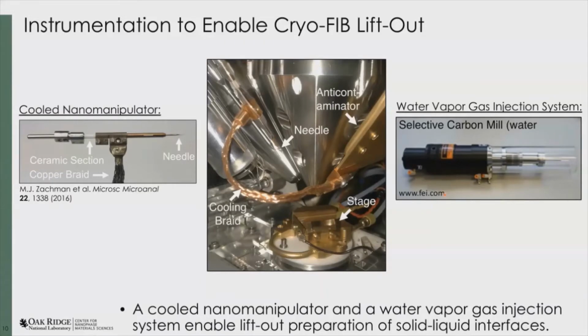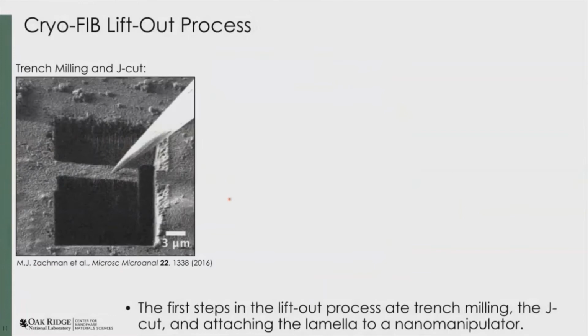So it's not a controlled deposition in the spatial sense, but it doesn't contain any carbon, so for our purposes that's very important, and it doesn't contain any heavy materials, so it doesn't interfere with imaging if there are any little remnant pieces left over. So let's look at an example of how this actually works.